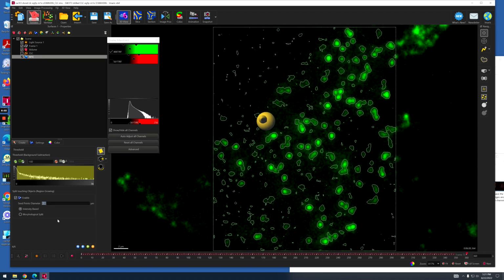Enabling this basically just sets the seed point diameter.